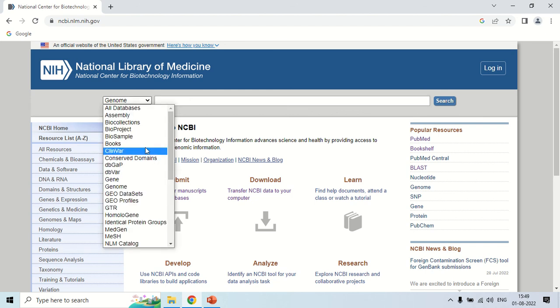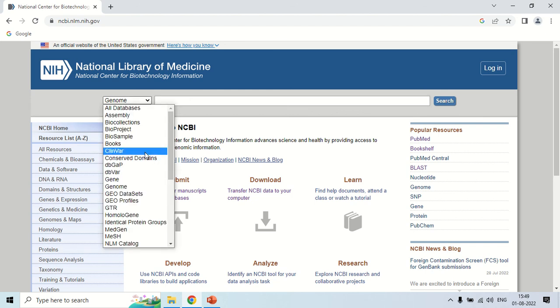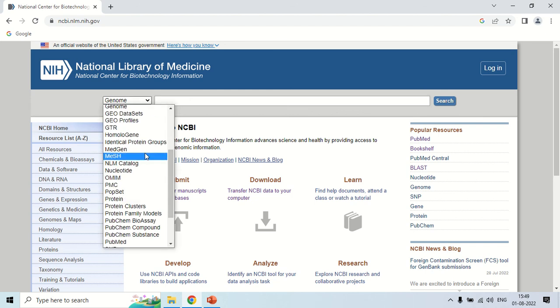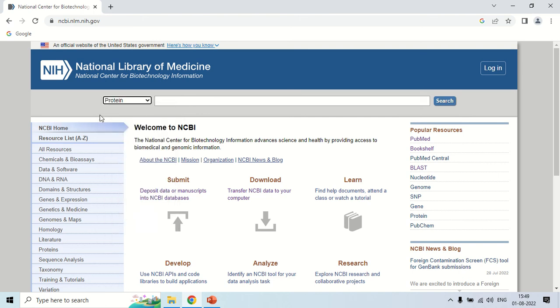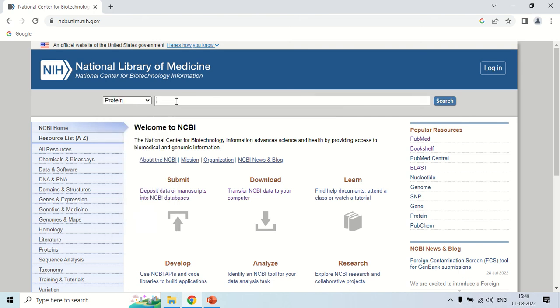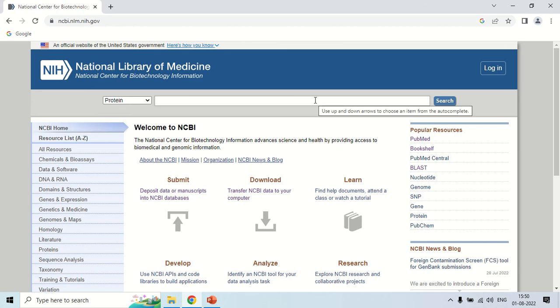Another important option is proteins. If you want to get the data or sequence of proteins of a specified organism or gene, just select protein here and write your query in the box and click search. As you click search, results will be displayed in front of you as I showed you for the nucleotide database.